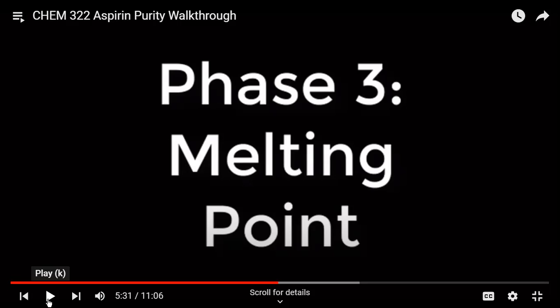Then Percy Julian synthesized the same compound, but the melting point was different. But he knew he had the right compound. So he wrote a paper himself refuting the other guy's publication, because he said there's no way you had that, because that's the wrong melting point. So it was a very important characterization method, and if you don't have other means of characterizing compounds, it's actually very effective.